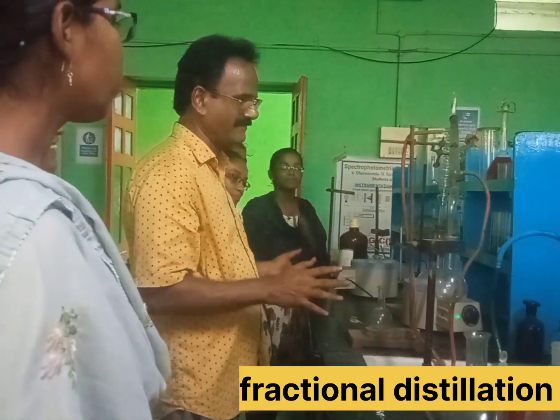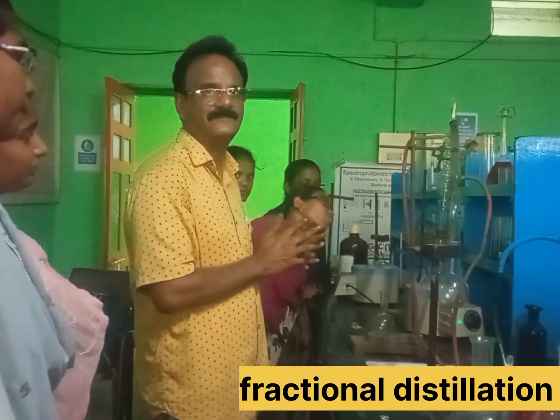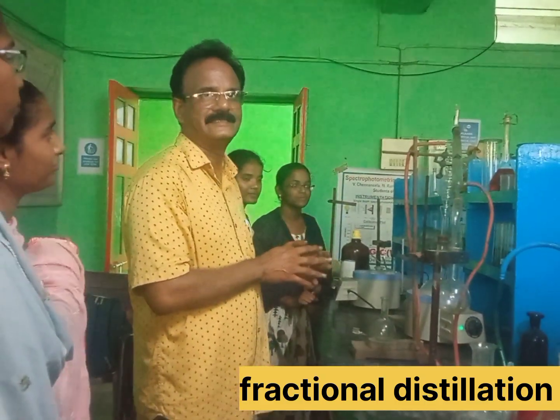This is the set up — this is the fractional distillation set up.